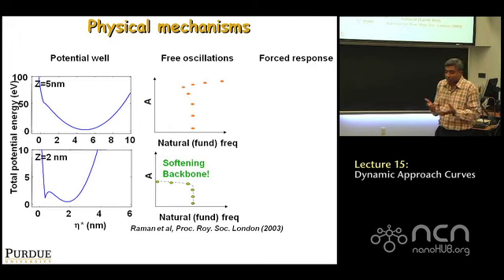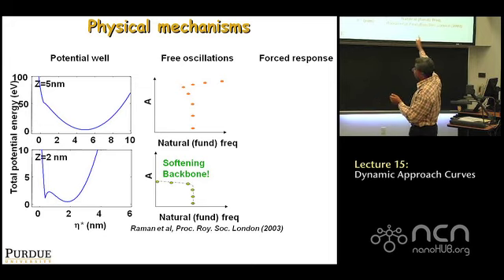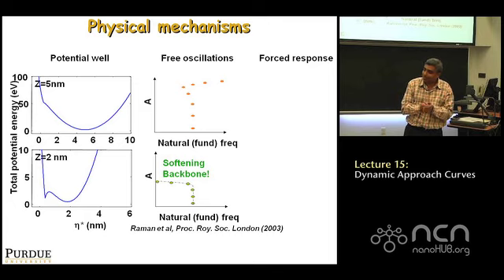So if your job is to make sure you're shaking the cantilever, you're tuning, if you're trying to make sure that you're always at resonance, what it means is, if you're trying to increase the oscillation amplitude of this cantilever, you first start driving the cantilever at its natural frequency, right? So the amplitude increases, keeps increasing, but if the amplitude increases a lot, the natural frequency is going to start shifting to the left due to this amplitude-dependent effect. So if you want to stay at resonance, you then need to reduce the frequency a little bit to keep it at large amplitude, and then keep building up. So if your objective is to build the amplitude as much as possible, what you need to do is to be clever about it.